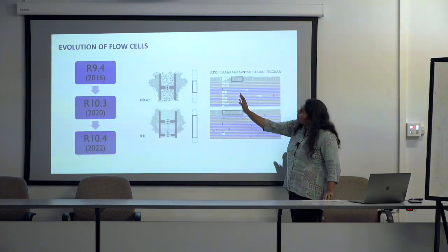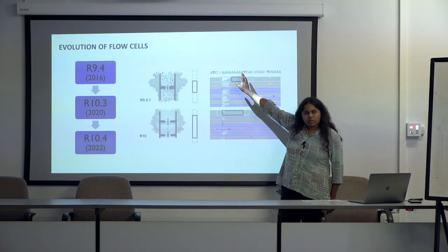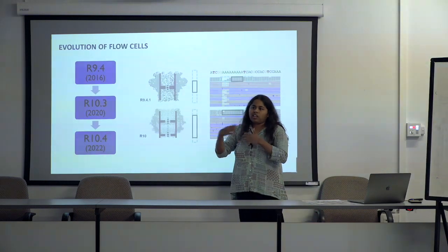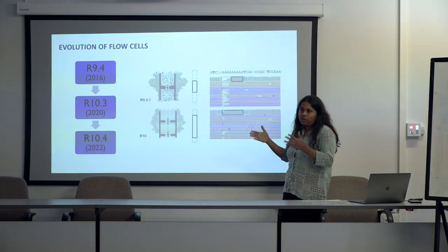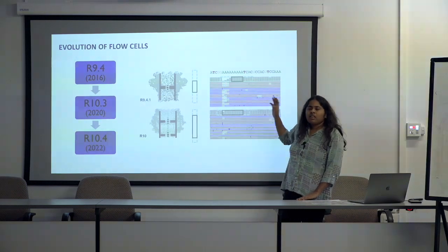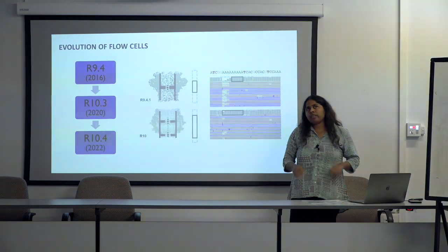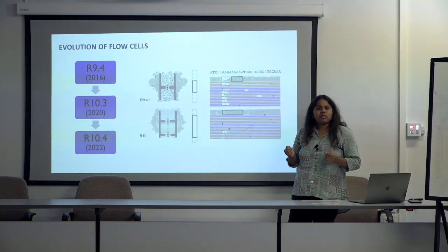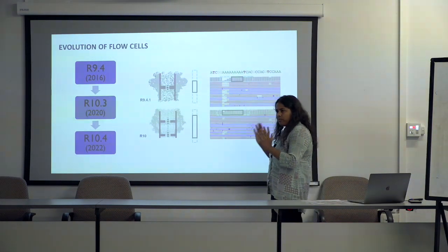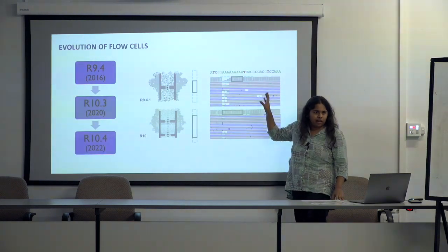And the changes are being read, and the biggest challenge had been that it would create some sort of systematic errors. So you have a homopolymeric stretch, and you're not able to actually see the changes in the electricity because you don't know how long that has been happening. So these would often create these types of systematic errors. And this was a challenge with CO1 barcoding because CO1 does have homopolymers. So if people have examined these data sets, they'll always see these regions of poly-As and poly-Ts. And this caused some of the initial challenges that we had when we were trying to develop this pipeline.